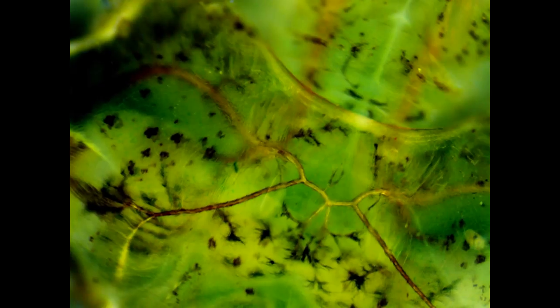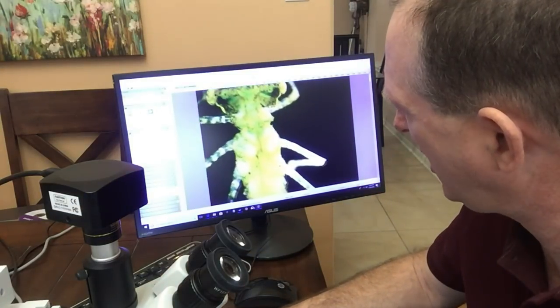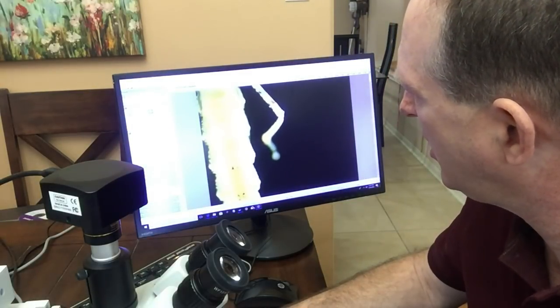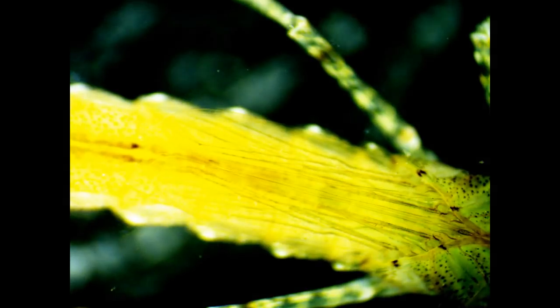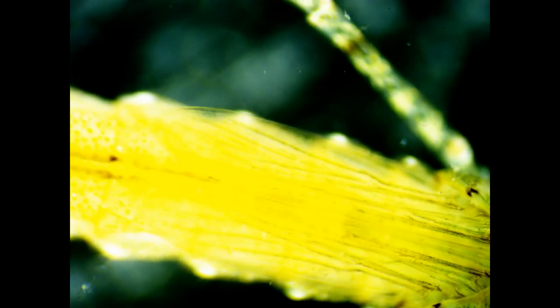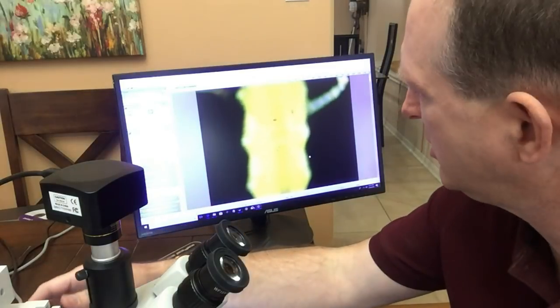And I'm going to show you, this is really interesting. You can actually see the wings that are being formed. See right here, you can actually see the wings being formed. Look at that, see that right there. And let me see if I can zoom in before he moves. Look, there you can see right there the end of the wings. And mayflies have four wings, so they got two sets of wings, the front and the back, just like a dragonfly.